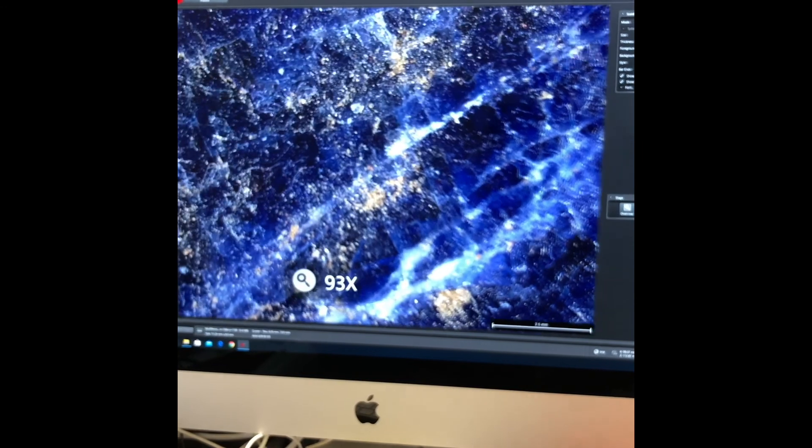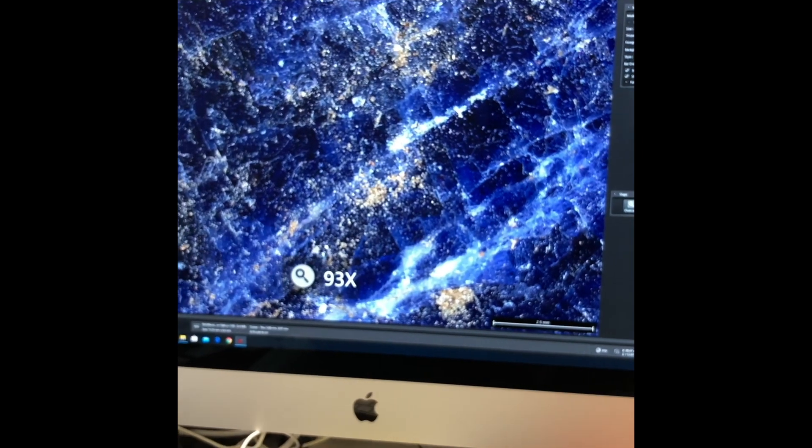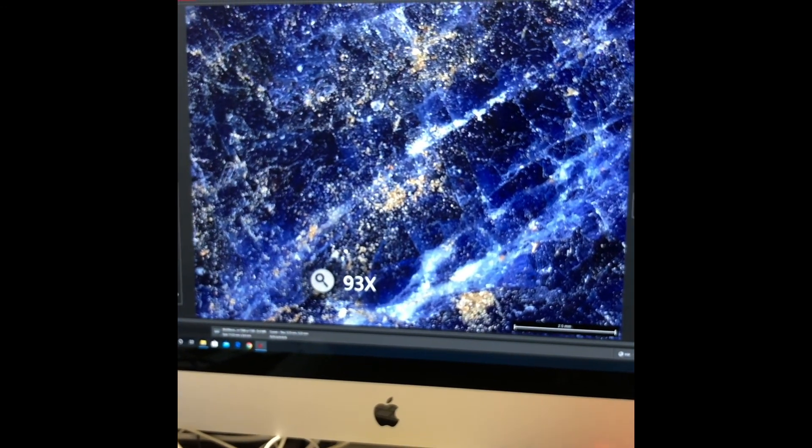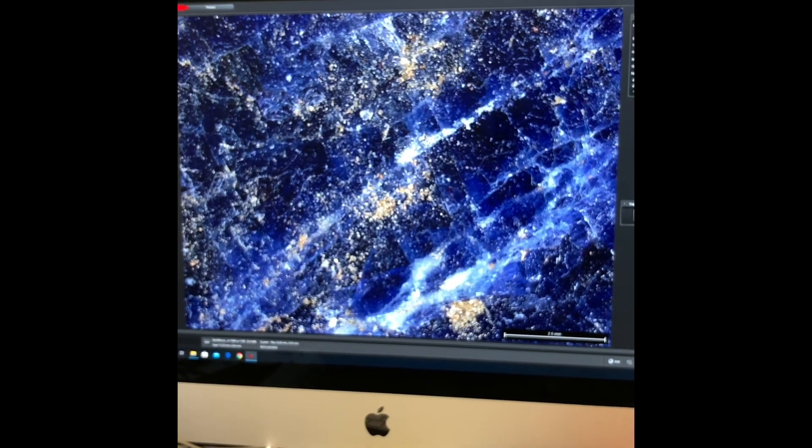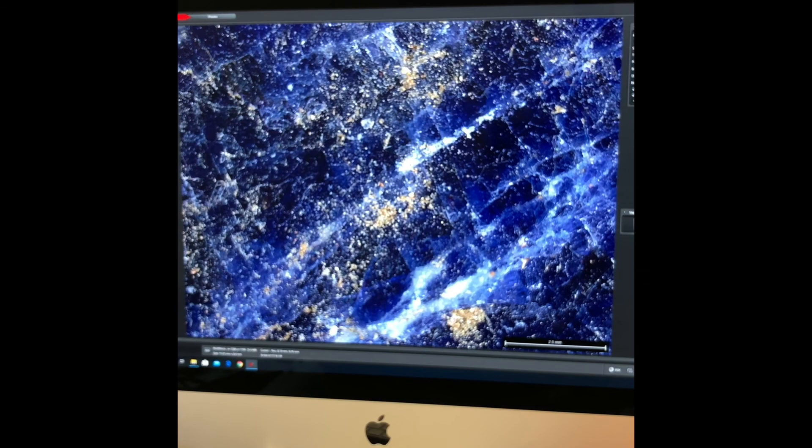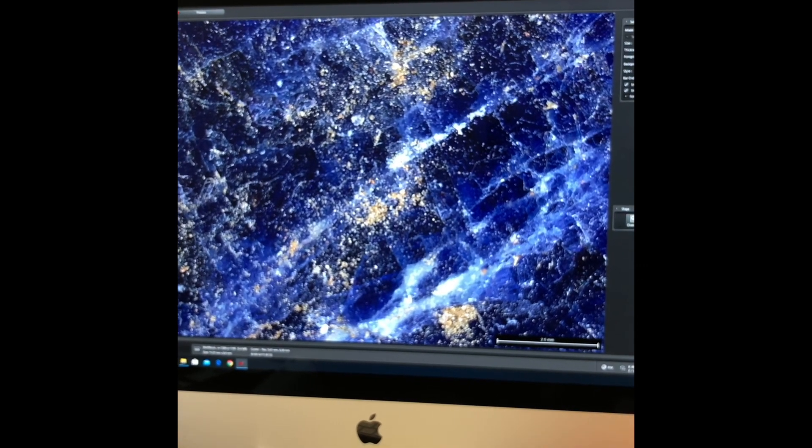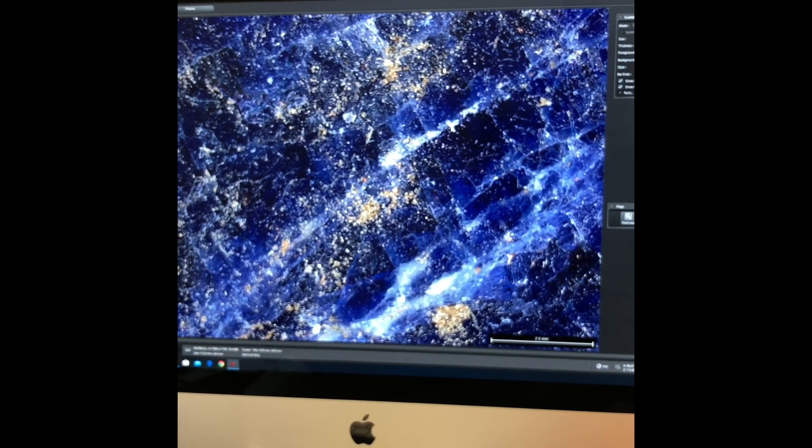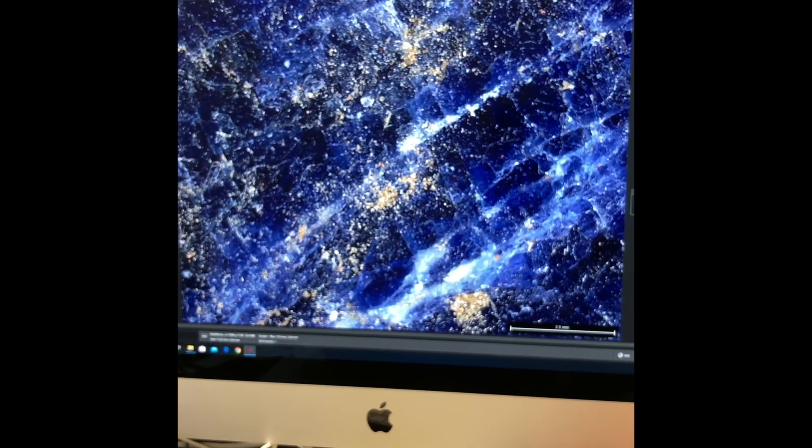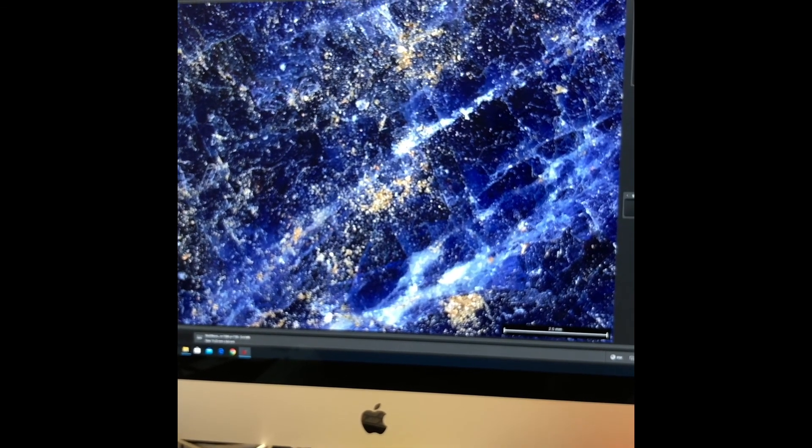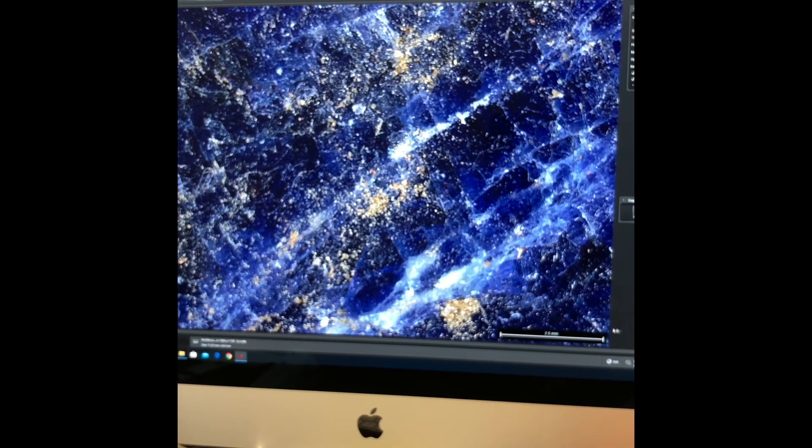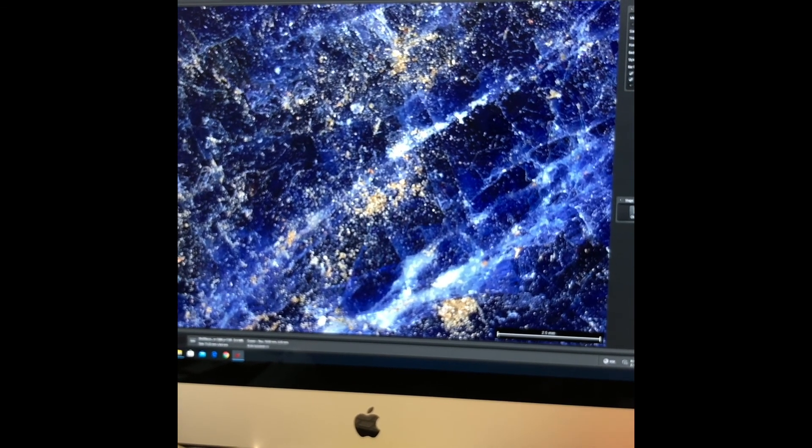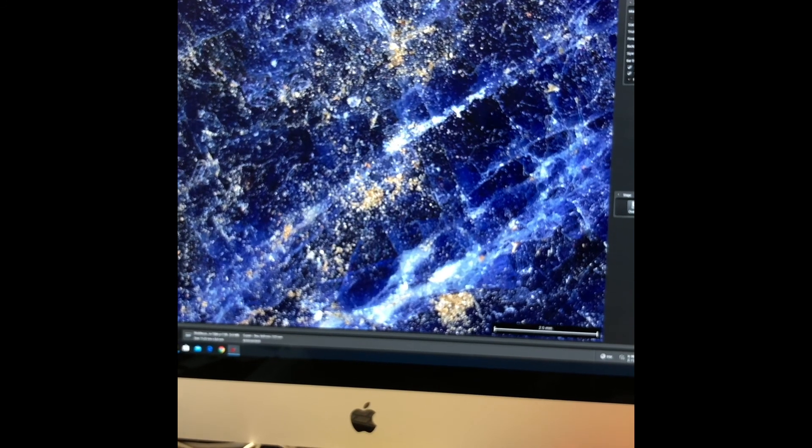After it's done, we can get this compiled image of our rock. As you can now tell, the whole thing is in focus and we have a very clear and crisp image of this entire region.